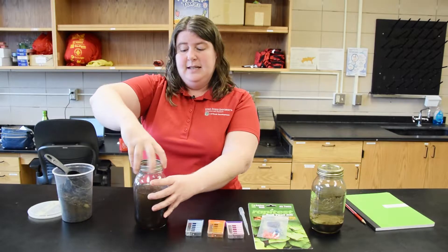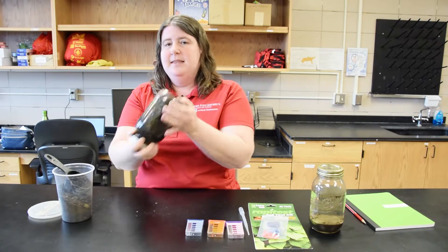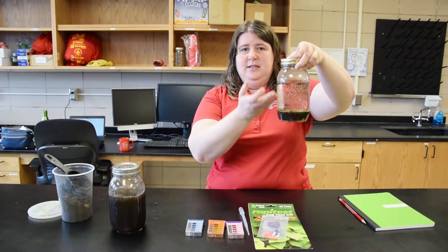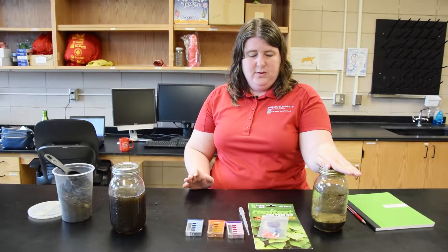You have to have a sealable container because you're going to shake this. You shake it for a minute and that will make a solution of the water and soil. After shaking, it needs to sit for at least two hours. It's best if you let it sit overnight, because then you'll end up with a lot of the soil settled to the bottom but a clear solution above. If the solution is too dark and cloudy, the soil test won't work as well.